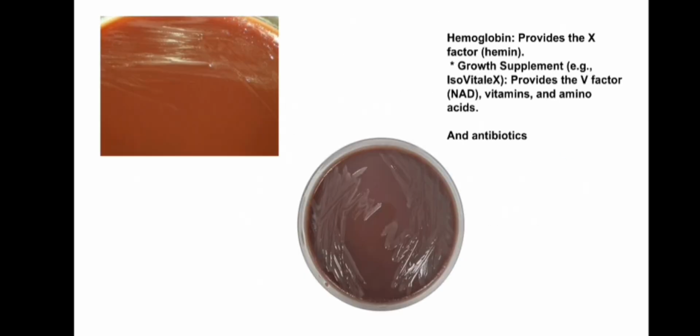Here's the illustration of a chocolate agar. The hemoglobin provides the X factor, hemin. So, X factor, factor 10.